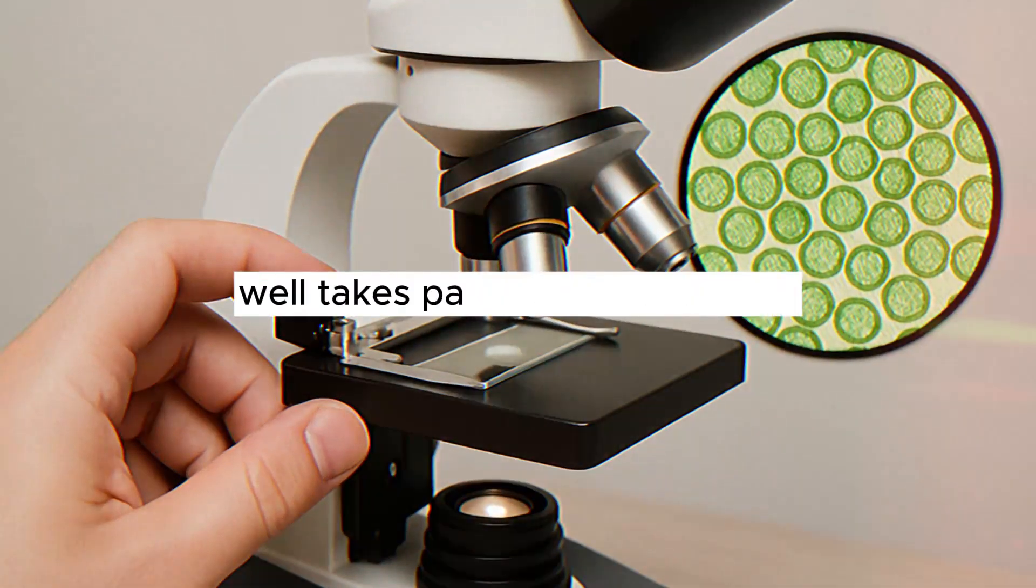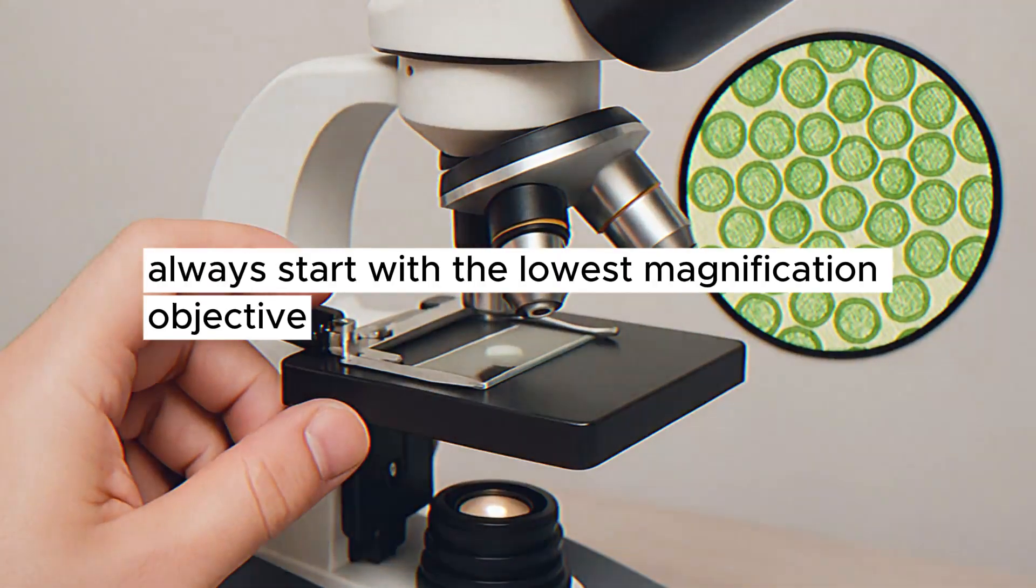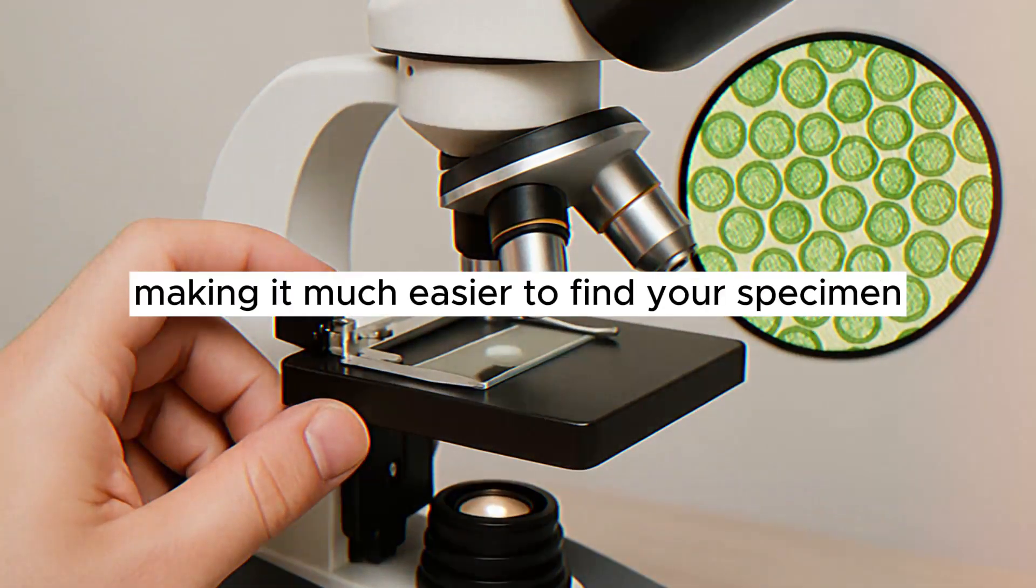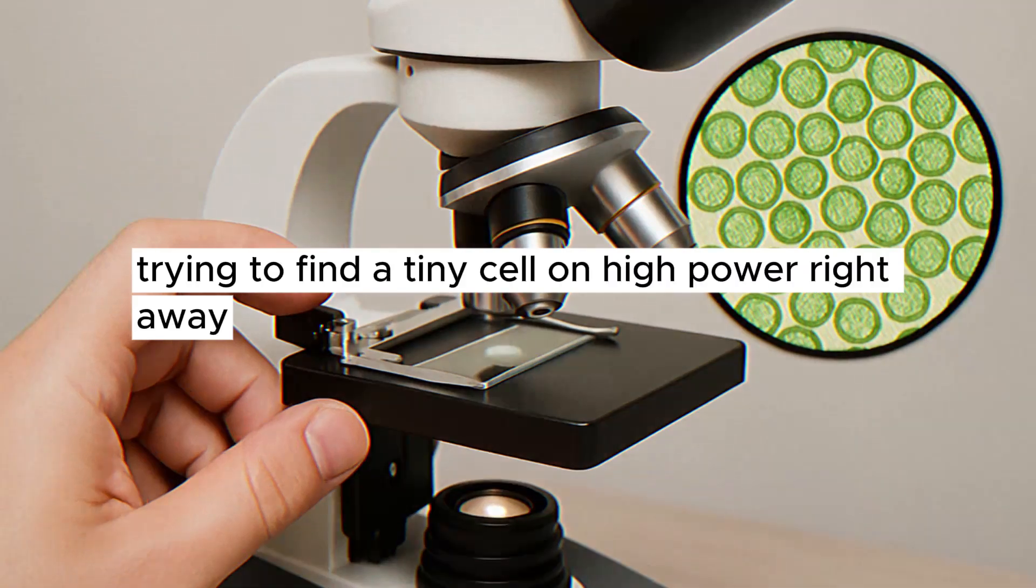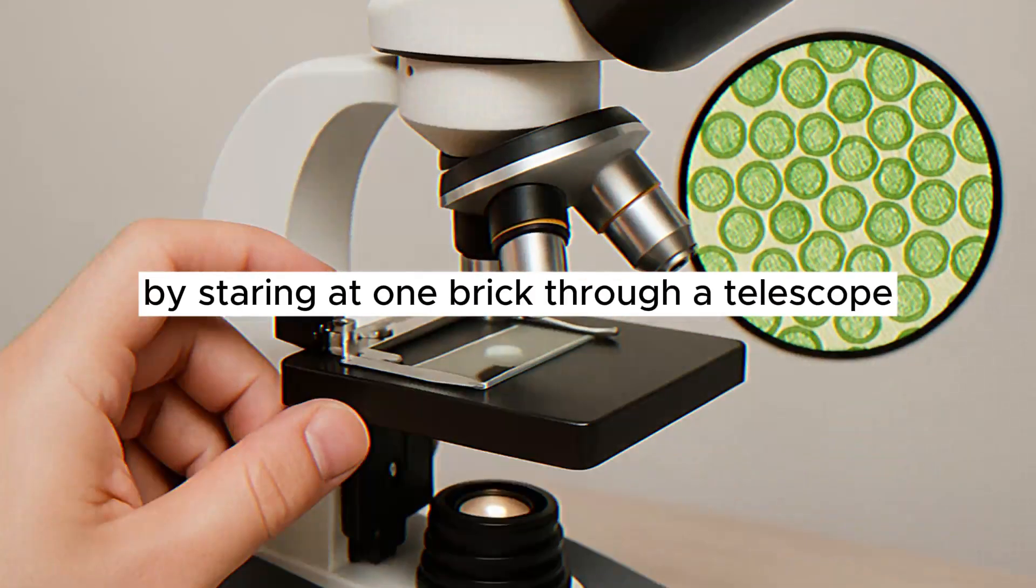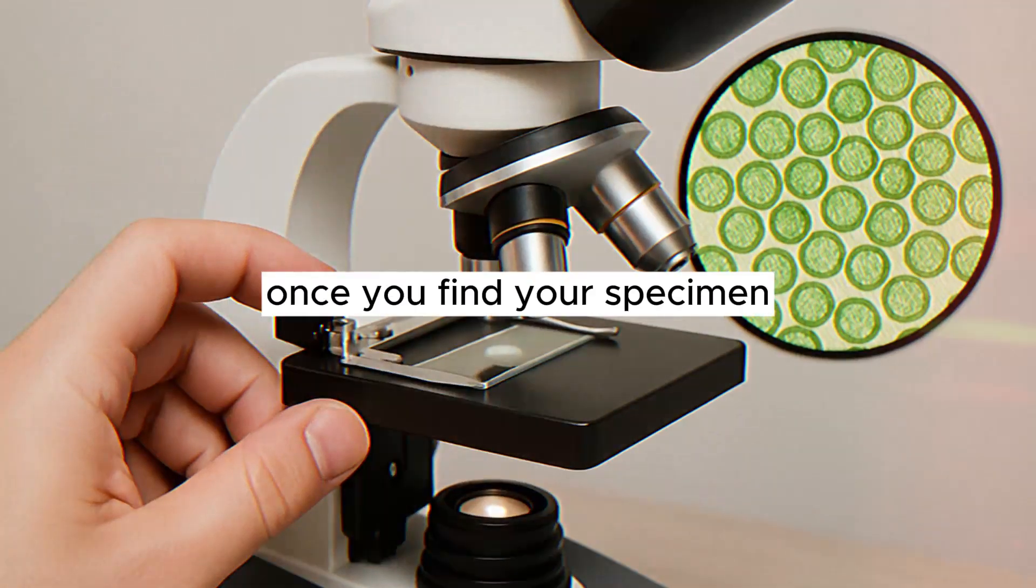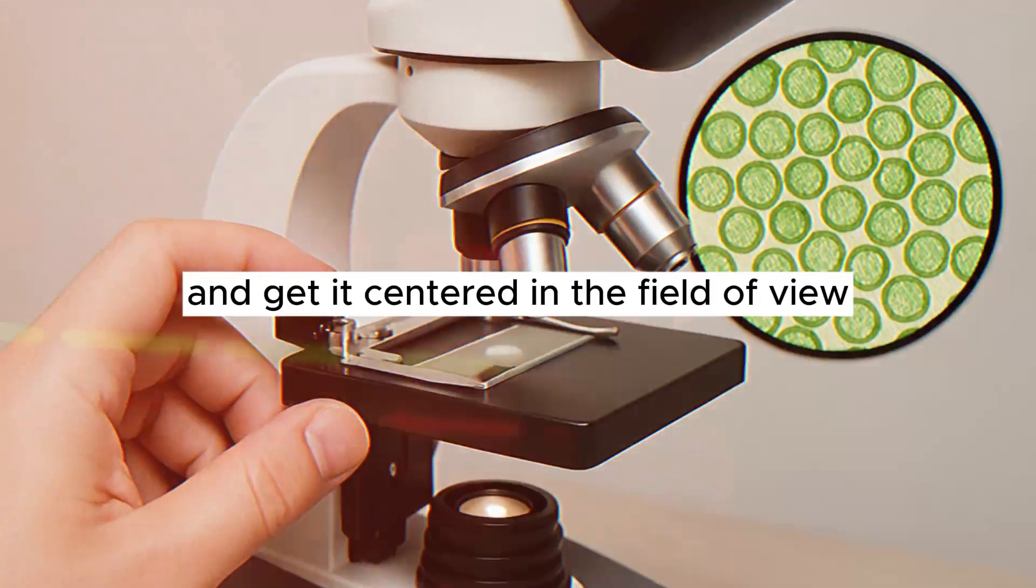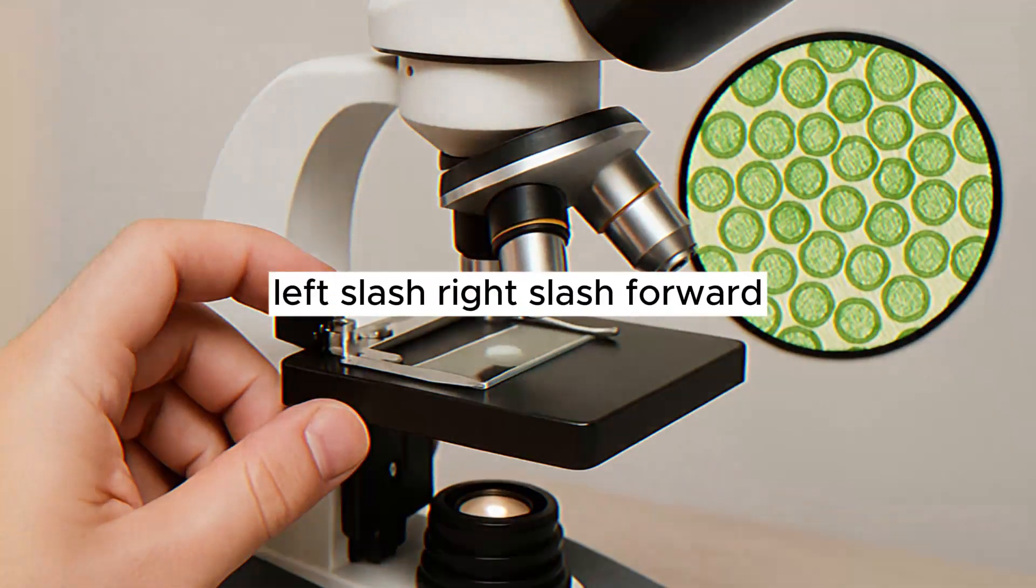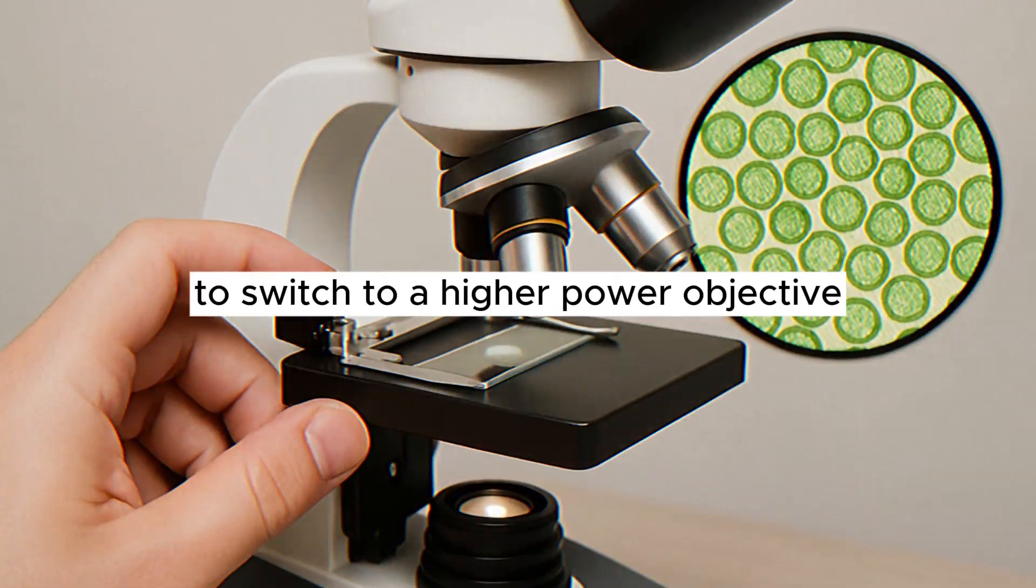Learning to use a microscope well takes patience and practice. Always start with the lowest magnification objective. This gives you the widest field of view, making it much easier to find your specimen. Trying to find a tiny cell on high power right away is like trying to find a specific house by staring at one brick through a telescope. Frustrating and nearly impossible. Once you find your specimen and get it centered in the field of view using the stage controls, those knobs that move the slide left, right, forward, back, then you can carefully rotate the turret to switch to a higher power objective.